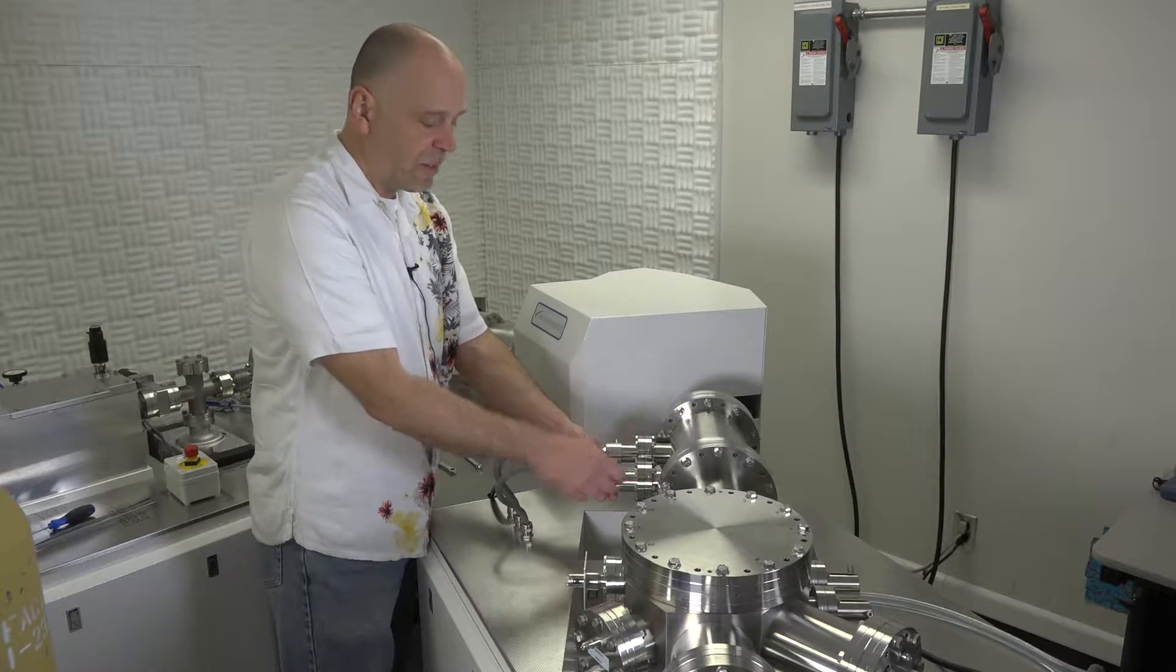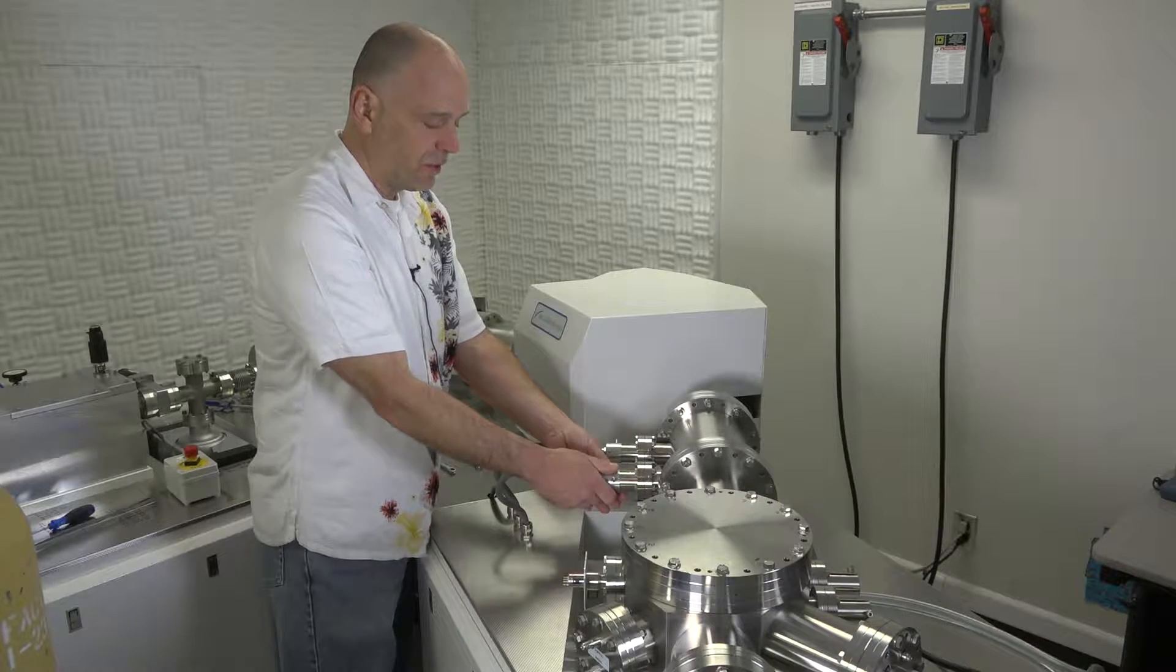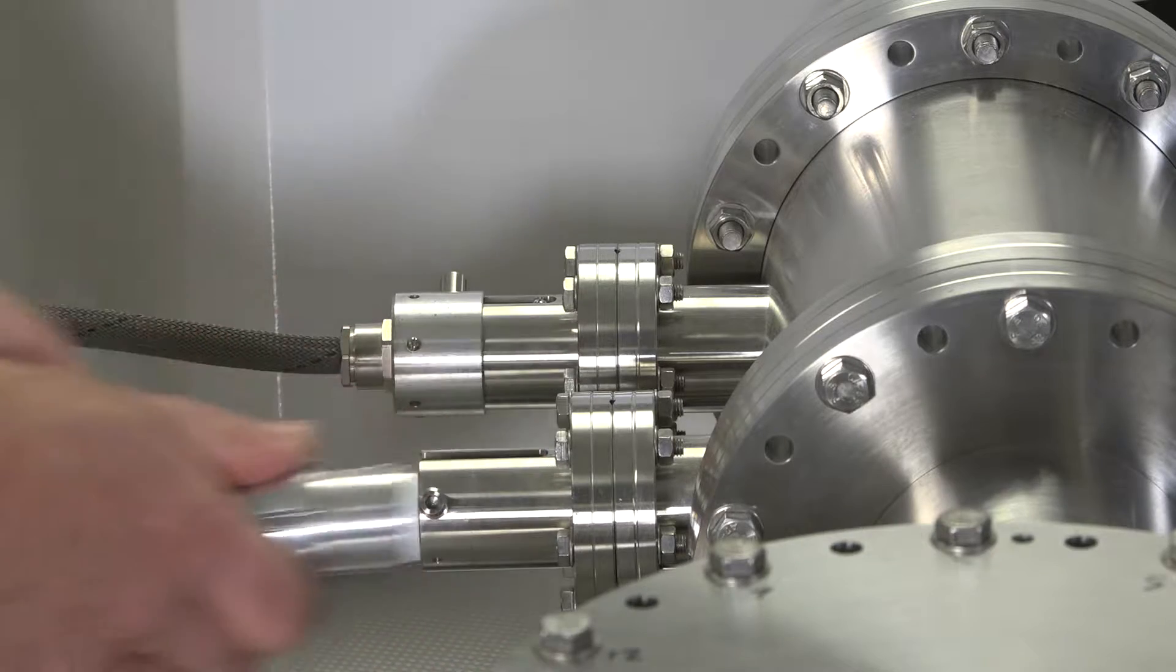The two feed throughs on the quad lenses also need to be removed. You'll do it in the same manner that you removed the previous feed throughs. Undo the set screw, pull them straight out.